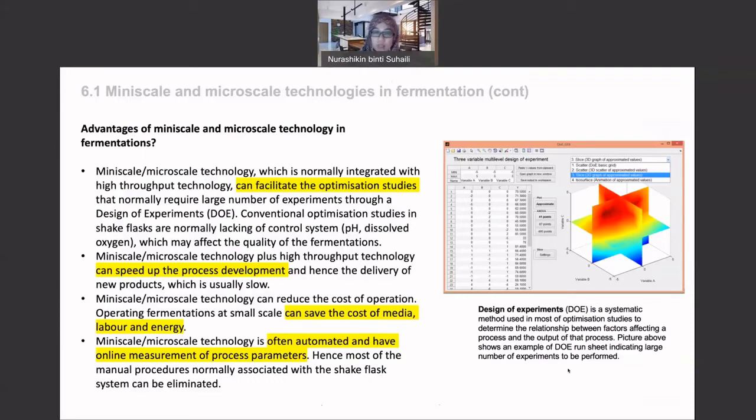So it means that you have to carry out lots of fermentations, quite a high number of fermentations, like 96 fermentations. That is not yet considering the replicates, not yet considering the errors. If let's say everything runs smoothly, which is not always the case, or not even the case at all, you might have to repeat. Yeah? For example, 48 is just the number of ideal experiments to be carried out.